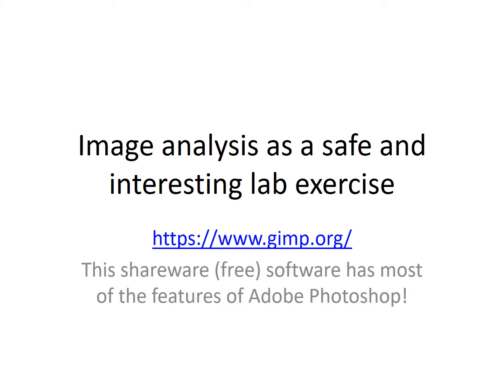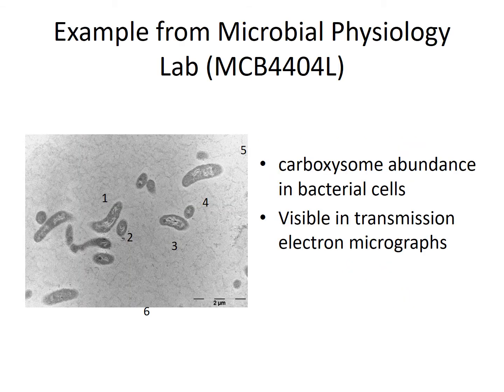Anyway, one of the tools that I used for the image analysis is listed here, the GIMP software. There's the URL for downloading it. It's shareware, it's free, it's pretty straightforward to use, and it also has most of the features of Adobe Photoshop, if you're familiar with that. So it's really versatile.